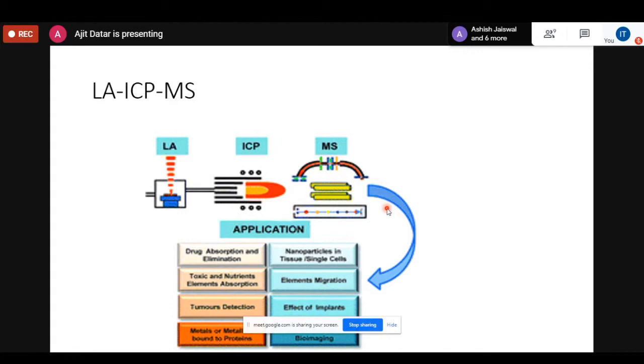There is some technique which is available to find out the state of arsenic, whether it is arsenite As3+ or As5+. If you can take it into solution and retain the valence state, you can use ion exchange chromatography, and you will separate As3+ and As5+ and then push them into ICP-MS, and then you can determine total arsenic here.